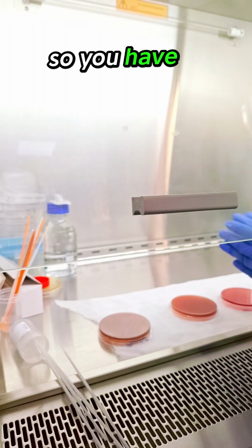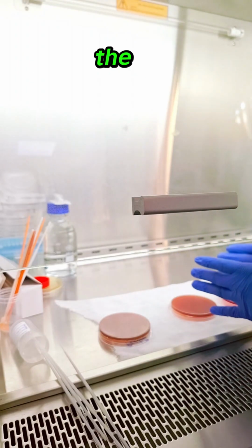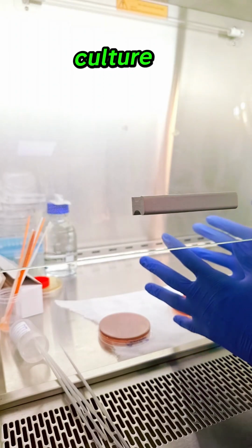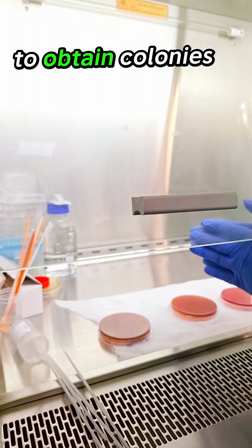By doing this, if you have two bacteria, you're going to do them separately, not like the other one that was mixed. You are going to do them separately because at this point you have separated these and obtained a pure culture, the colonies separate. Hence, by doing so, you are able to obtain colonies.